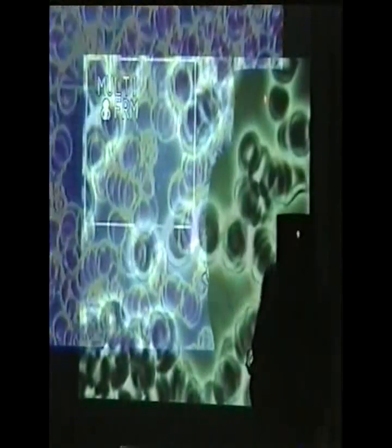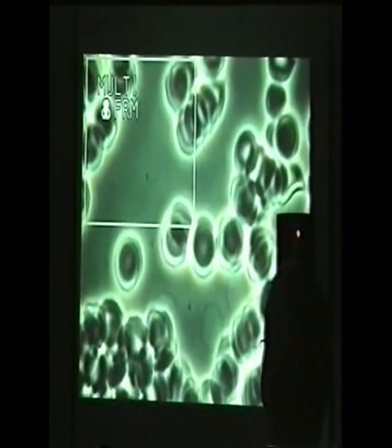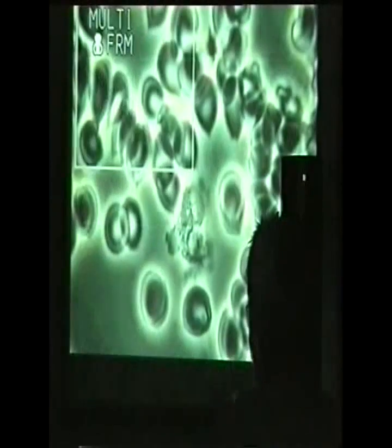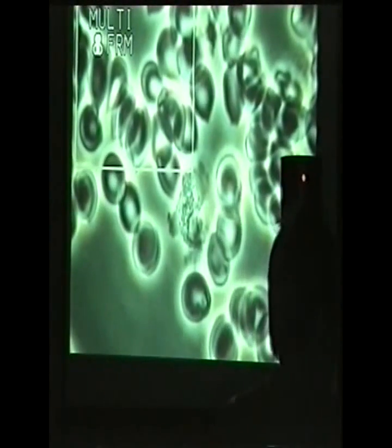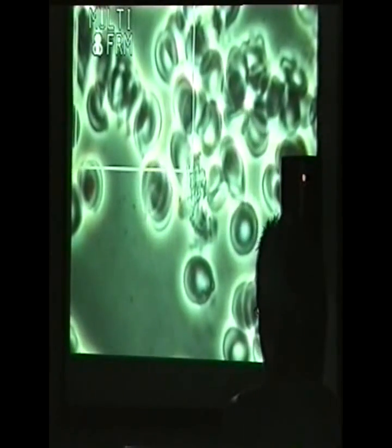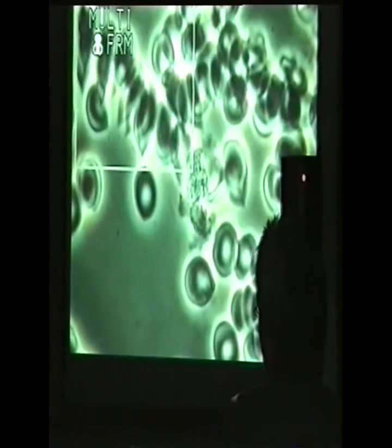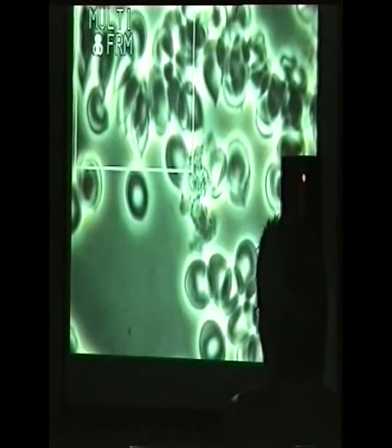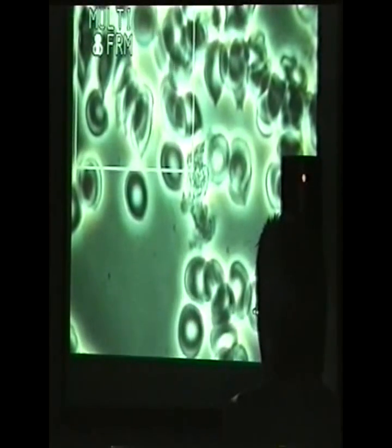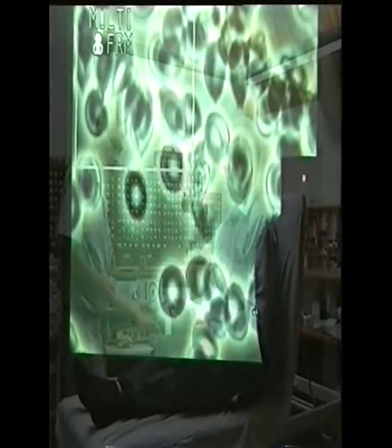In this phase contrast picture, the spaces between the cells are cleaner. The candida has disappeared. It's also very important that the inner of the leukocyte shows more activity. It moves beautifully. The conclusion of all this is that EMX increases the activity and functioning of both erythrocytes and leukocytes.